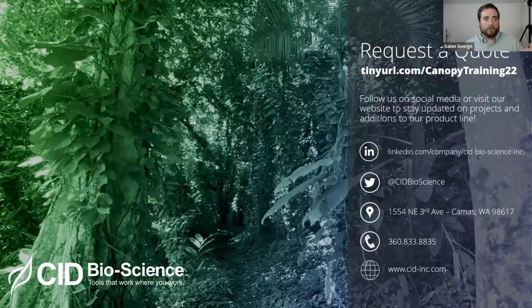But if you use 180 degrees, you're going to get the instrument, you're going to get yourself in the image. So it's just better to limit it to more of a 150 degree cone instead of letting it be a complete hemisphere. You can change that if you want. If you really want to see everything and put in the extra work to get yourself and all the other stuff out of the image, that's totally up to you, but we recommend keeping it at 150.